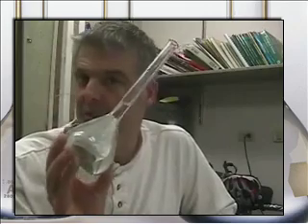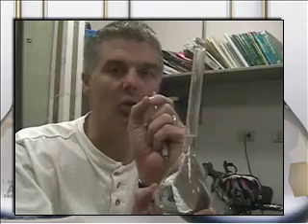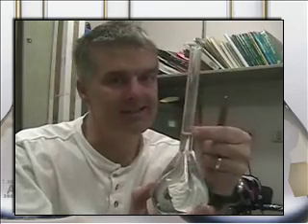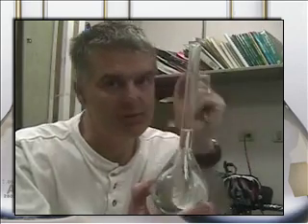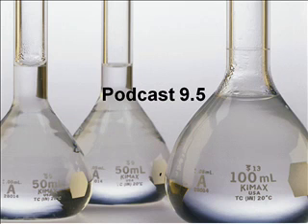Folks, remember last time where we learned about solutions and how to make up a solution? I still have that solution of nickel(II) nitrate right here. What I want to do today is learn how to dilute it, to make it even less concentrated, in a quantitative way so we can find out the exact molarity of the new solution. So hence today we want to talk about dilutions.